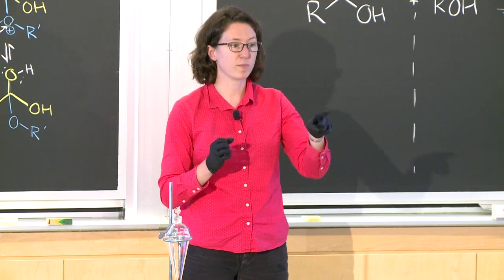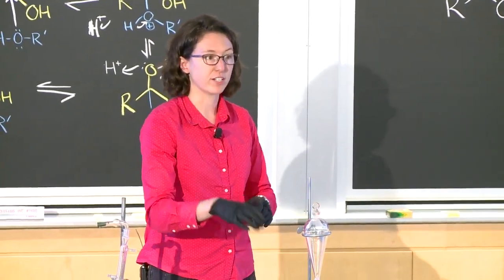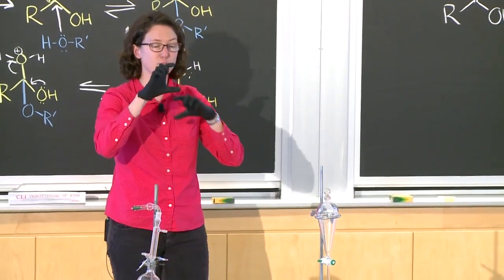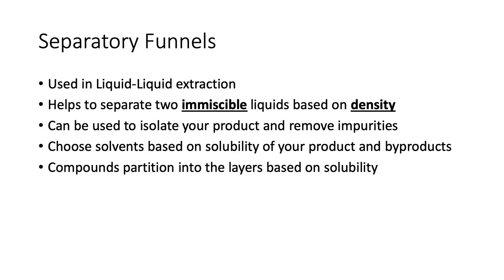They won't mix together. They don't mix together. Good. So when you pour your two solvents in here, they need to not mix so that you have two distinct layers and that you can separate your product between them. And it will separate them based on density.